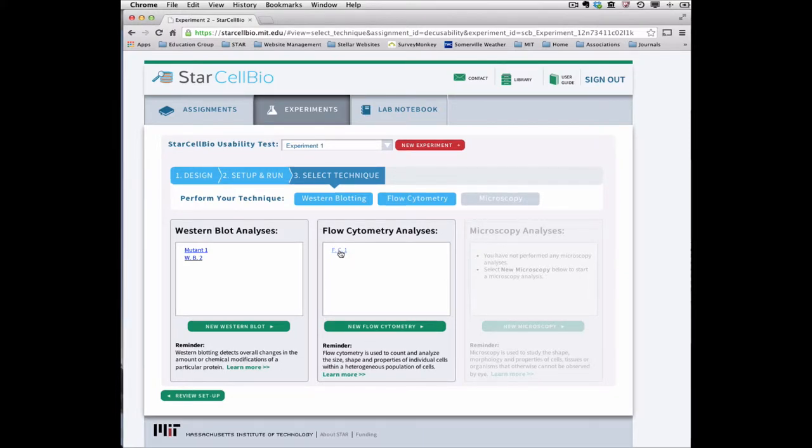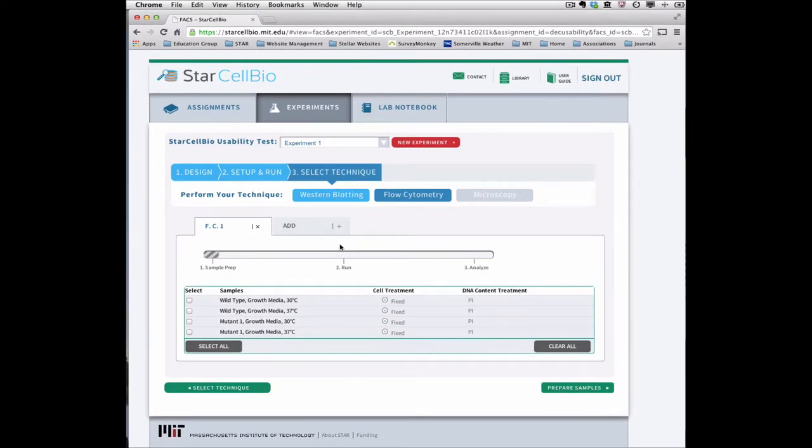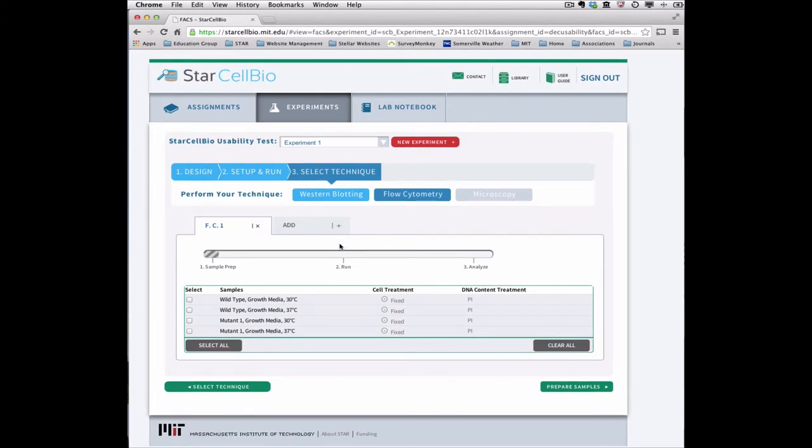Many aspects of the flow cytometry experimental technique page should look familiar to you. In particular, the flow cytometry experimental techniques are organized into tabs, and there is a progress bar displaying your progress through the three steps of a flow cytometry experimental technique.